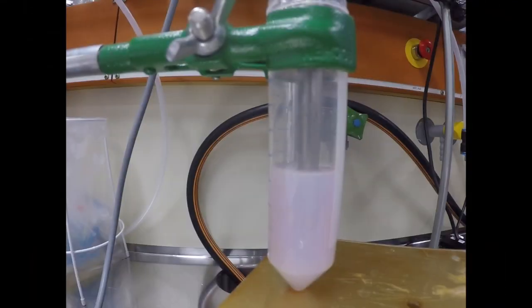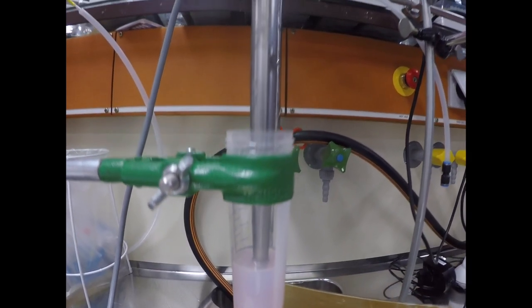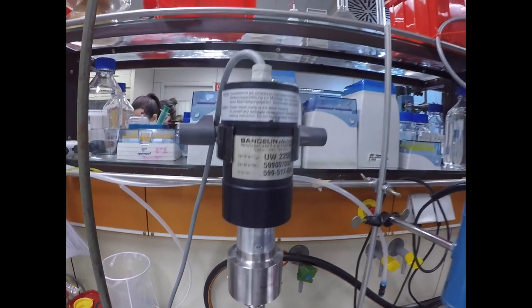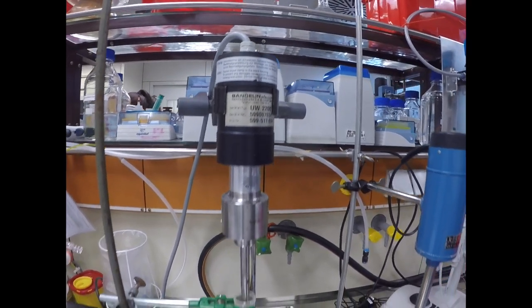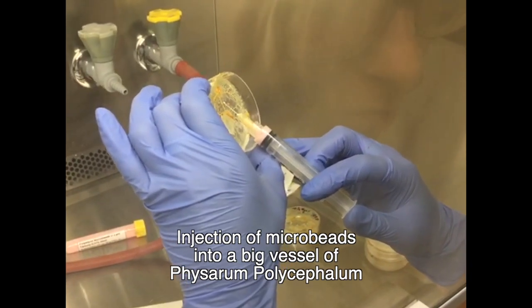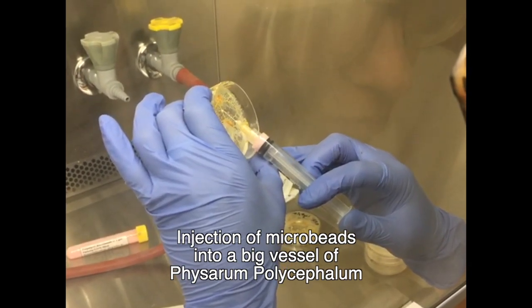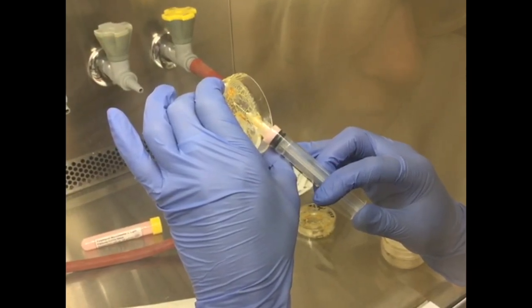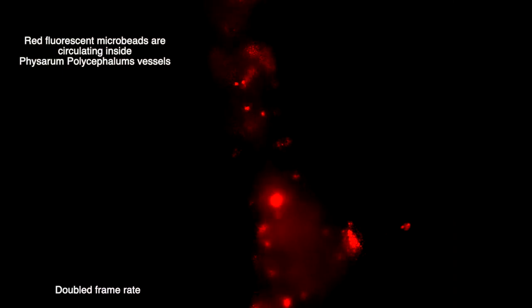As a microplastic representative, we used PLGA particles, which were synthesized through a water-oil-water emulsion. As a fluorescent dye, we used Nile red. After injecting the fluorescent microbeads, we observed the oscillation behavior of the slime mold. The microbeads were floating through the slime mold vessels and seemed to adhere to their walls after a certain time.